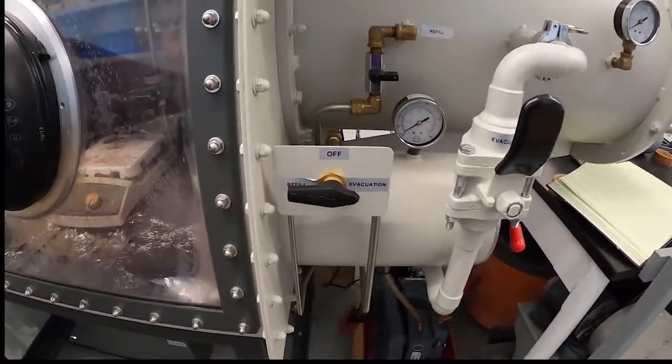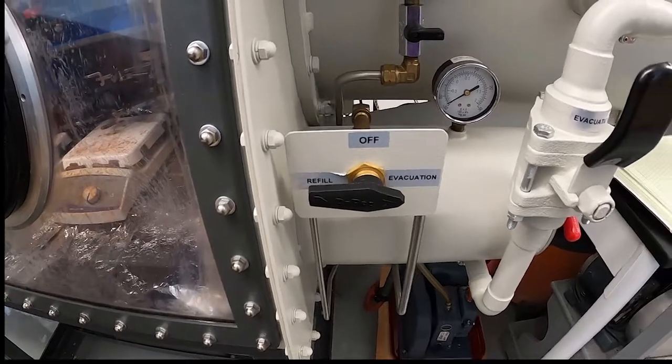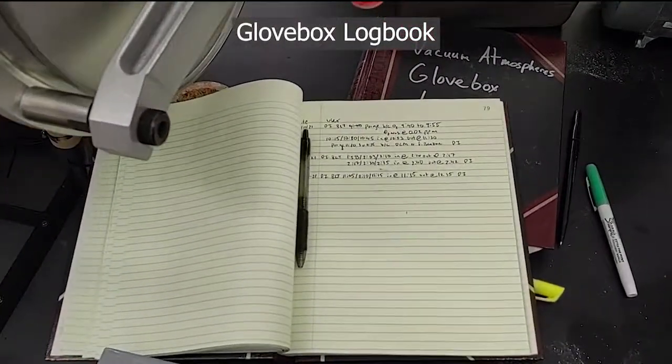Here are our ports. Ours has a single selector for evacuation or refill, which prevents having both on at the same time — unlike the one down in the 410 lab. We have the large port there, and there's our glove box logbook.